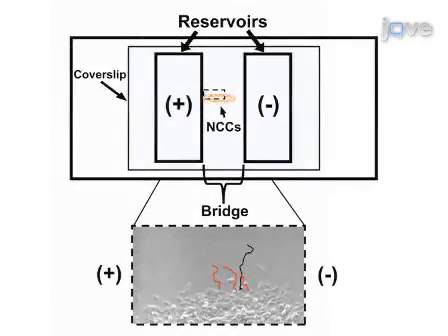The third step is to generate a molecular gradient across the culture and then film the migration of the peripheral neural crest cells along the previously selected straight border of the culture.